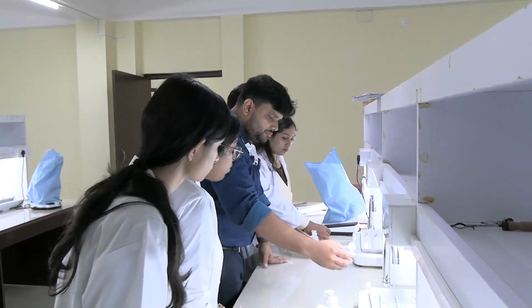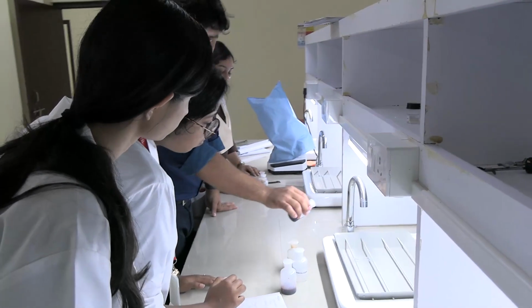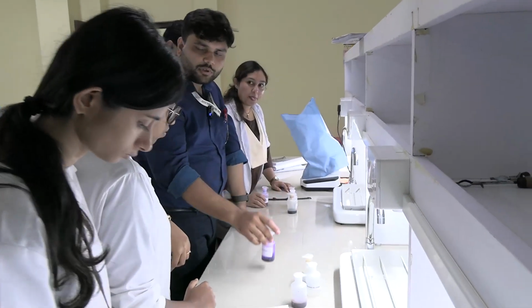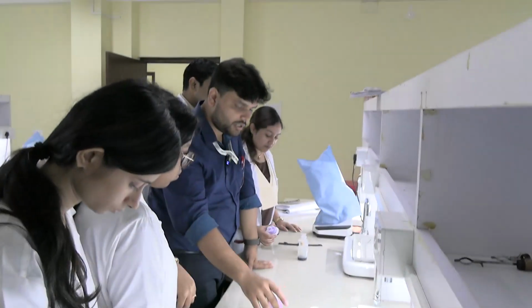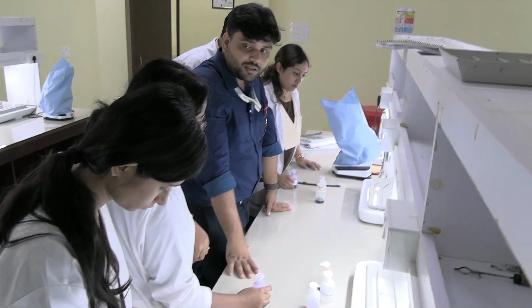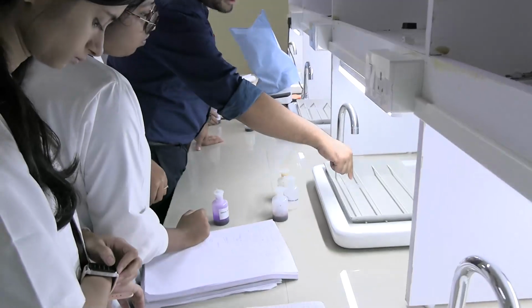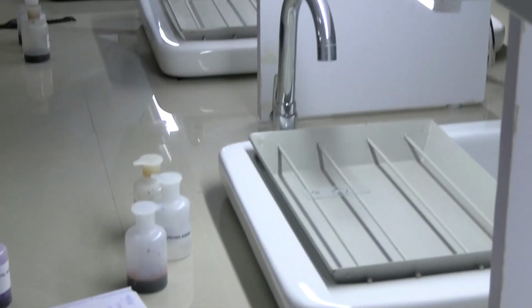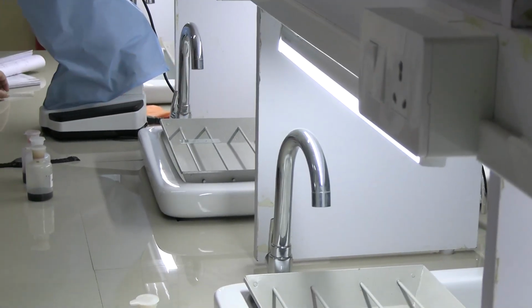Take the dropper and make sure you squeeze, okay? Because sometimes the liquid, for example the crystal violet, may not come out if you don't squeeze it hard enough. You have to flood the smear, not the whole slide, this much only. Our talented lab technician has already encircled the area that you need to cover, so you need to cover only the encircled area with the smear, okay?